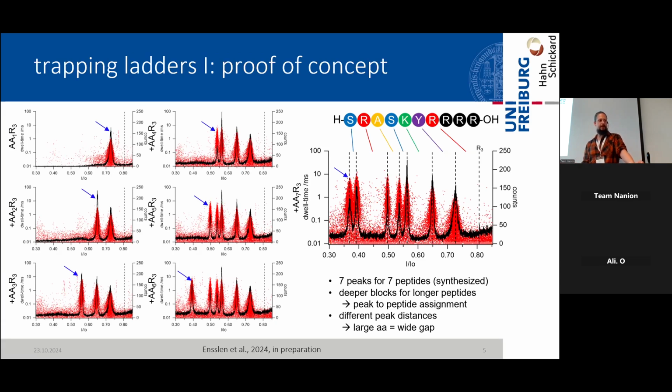And on the other side, actually, we have a limit currently. This is why it's indicated here with this dashed line, R3. So a tri-arginine peptide is the smallest peptide we can currently measure. Most of the time this is a bandwidth limitation, because when they are very small, they just run through the pore very, very quickly. But again, molecular engineering of the pores is key to that.